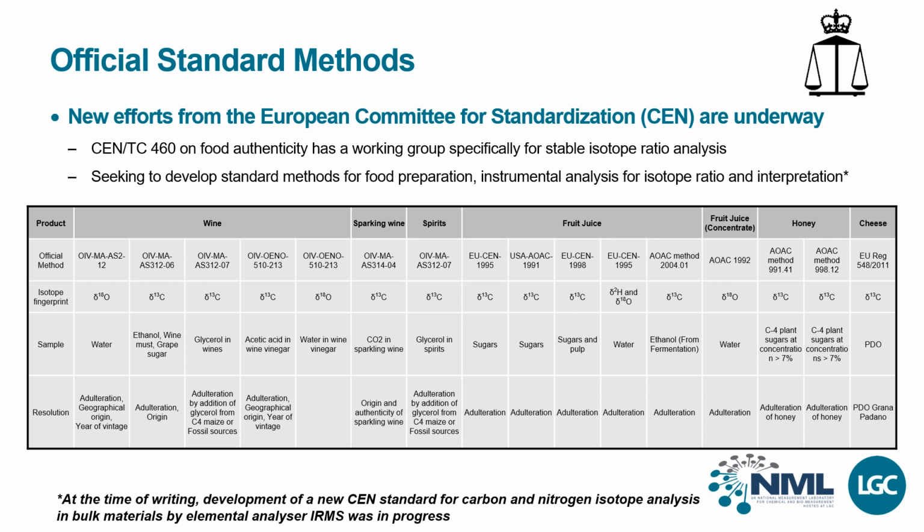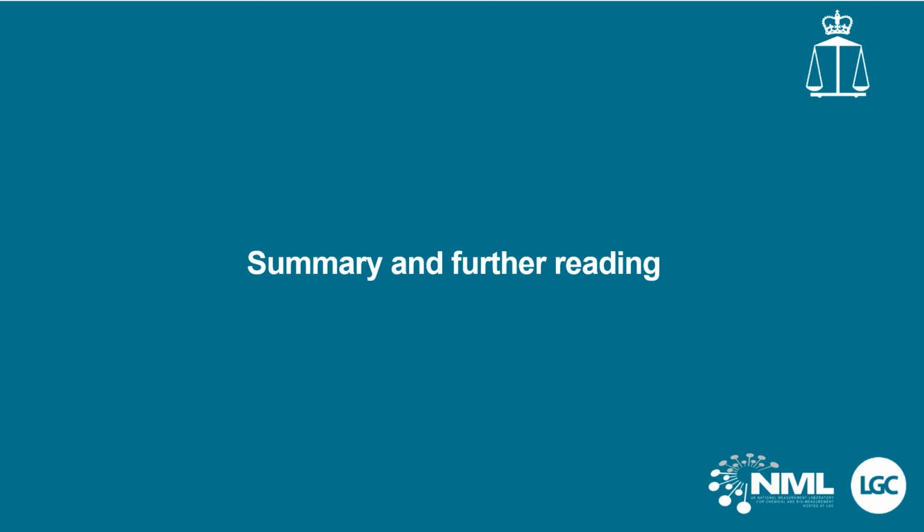It is also recommended that laboratories are accredited to ISO 17025 or equivalent. Finally, CEN Technical Committee 460 on Food Authenticity, Working Group 6, is dedicated to the review and validation of IRMS standard methods and will publish a new standard for carbon and nitrogen isotope analysis in bulk materials by Elemental Analyzer IRMS. A summary of the key points and suggestions for further reading is now provided.